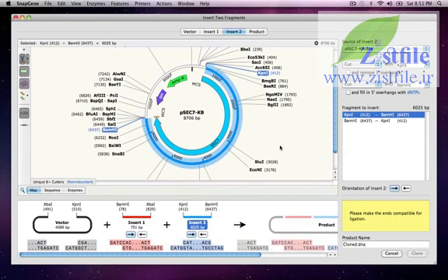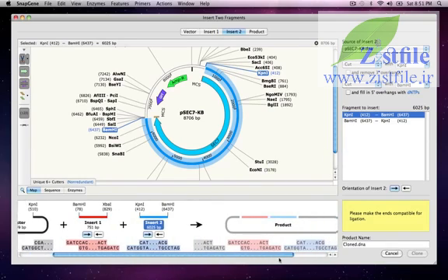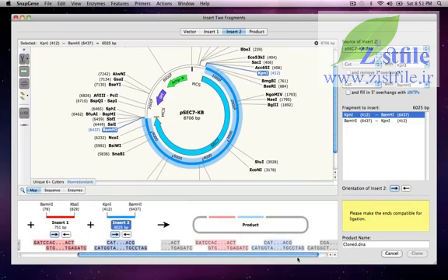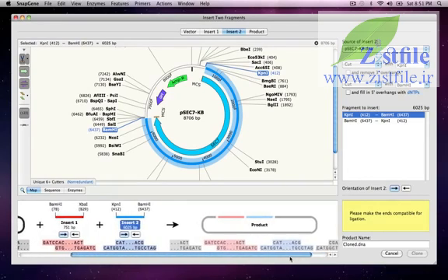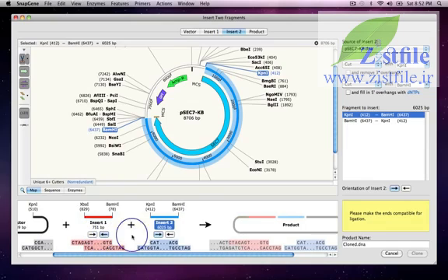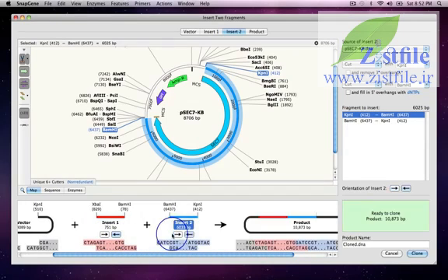Now I have my cut vector and my two inserts, but as shown in the overview at the bottom, I don't yet have a product because the inserts are facing the wrong way. So I click these buttons in the overview to flip both of the inserts. Now I have a complete product.